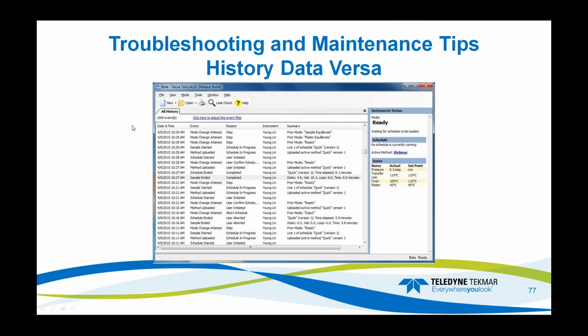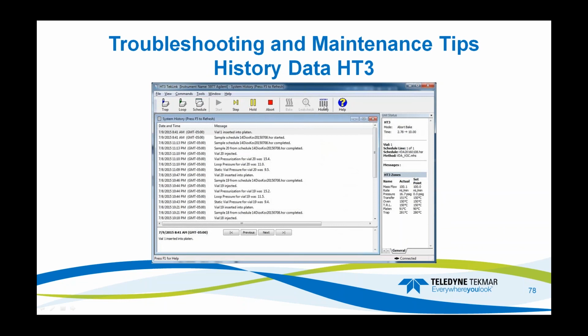The first thing we would do is go into Versa, click on View, and select History. Here I've displayed all the history that's available to look at. You can also sort the history to look at just method uploads, mode change attempts, or whatever. That is all available through the software. With the HT3, you click on the radio button for history. You can also go to View and select History there. It'll pull up the history for times that you want to take a look at.